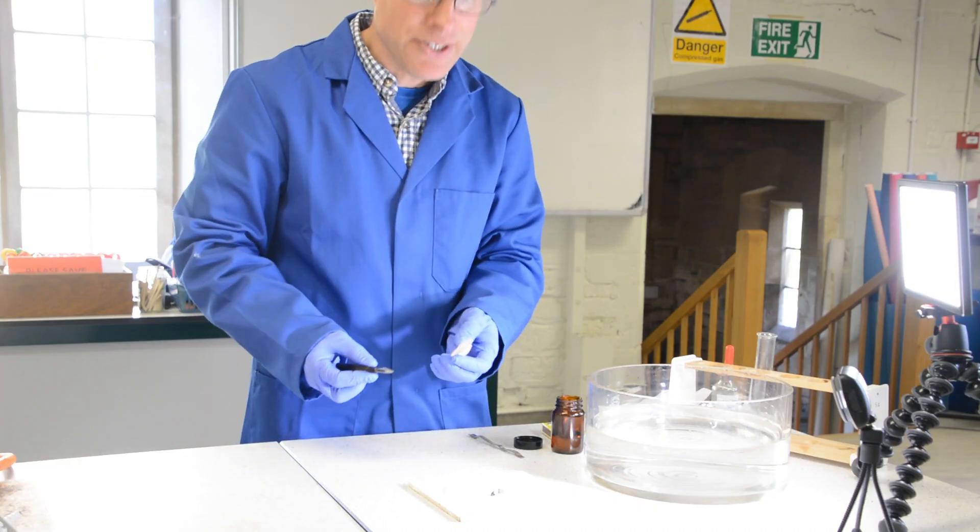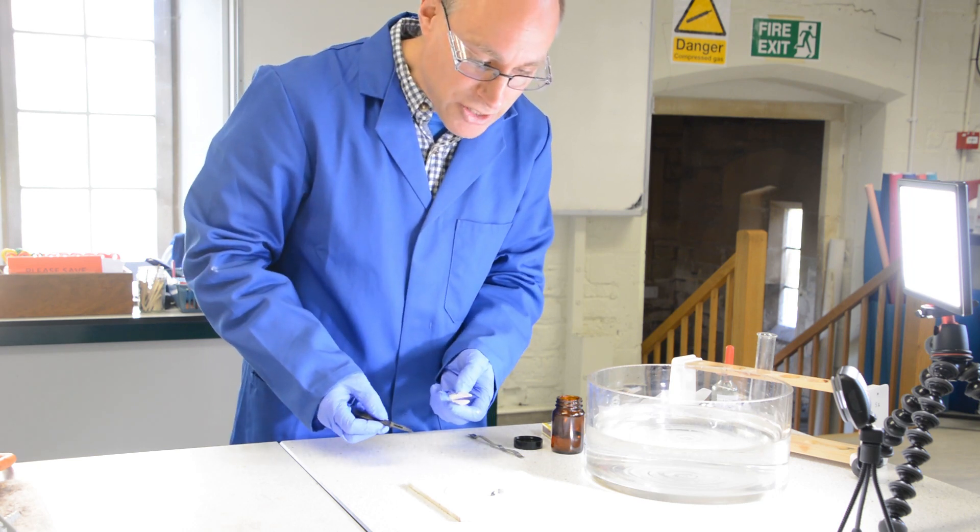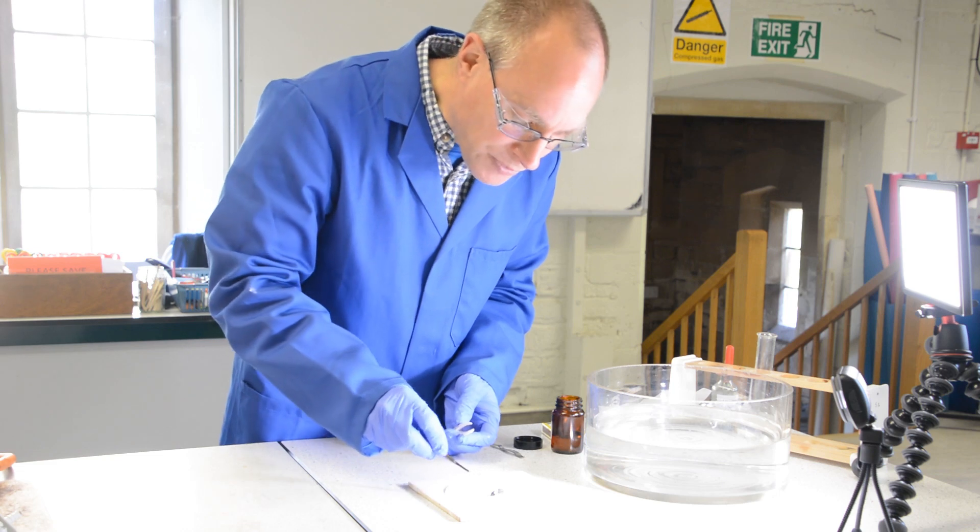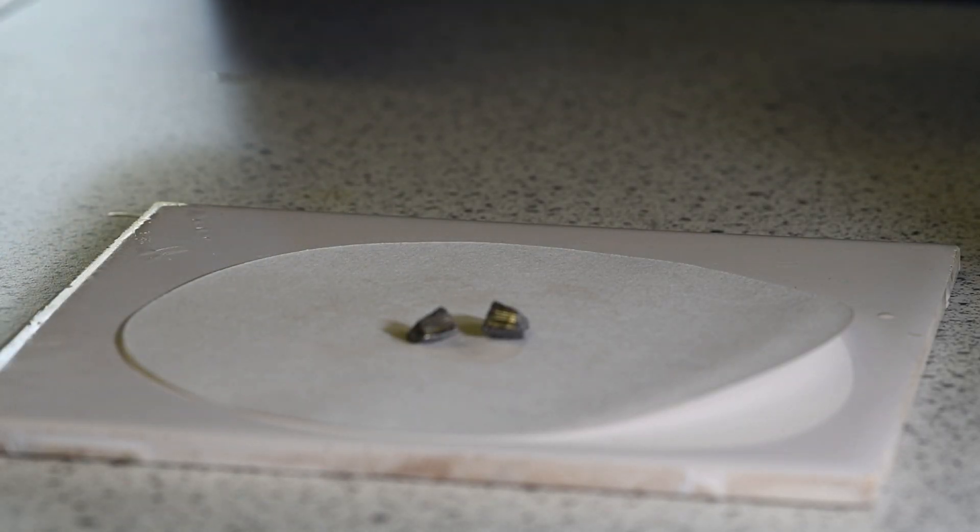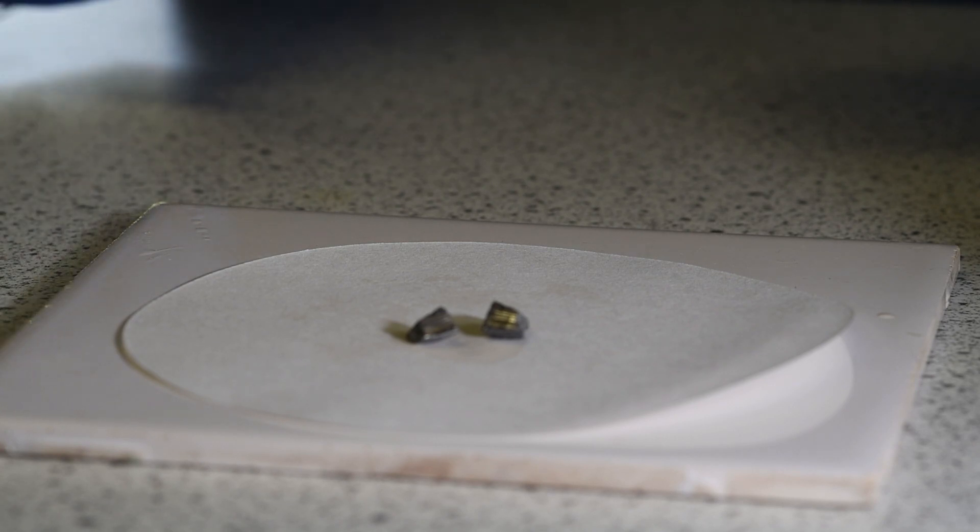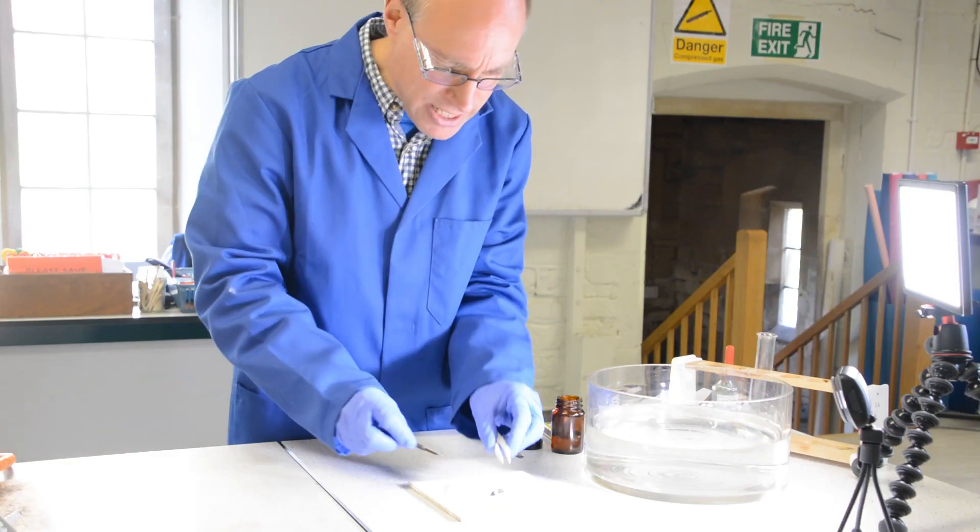So as you'd expect, lithium as a metal, when it's freshly cut, does go shiny. That cut surface there will start to tarnish very slowly as the lithium reacts with oxygen in the air. So that's lithium.